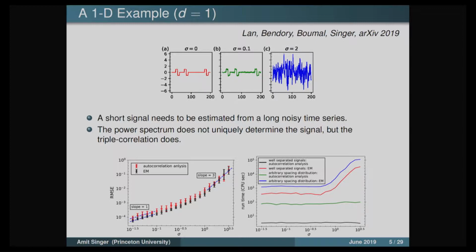Suppose it's like radar. Someone is using radar to detect objects in the sky, but you're just a listener. You don't know what template was being used, but you hear multiple noisy reflections, and perhaps you can figure out what the template was.